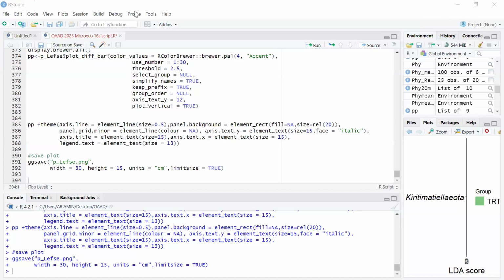Okay. Thank you so much for the question. Though I am just hearing the word "spiking" for the first time. What I just want to add here is that the absolute abundance may be difficult to determine. Apart from using qPCR, it may be difficult to determine at the bioinformatic level because it's actual concentration rather than a relative one.